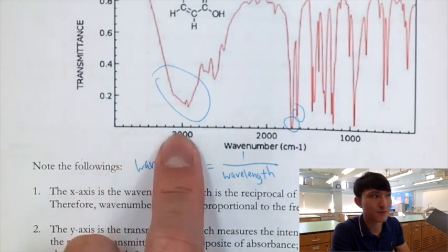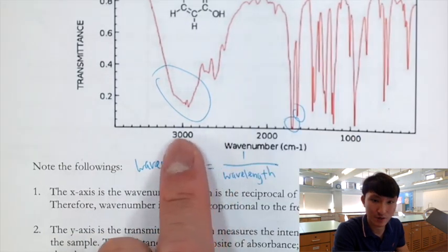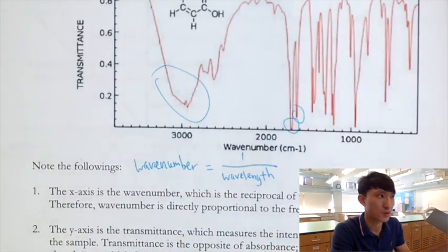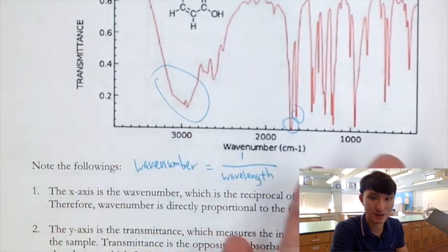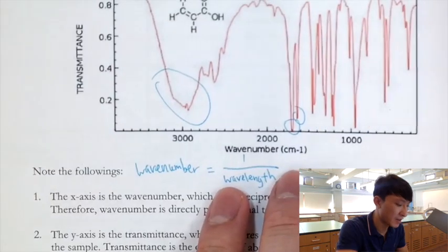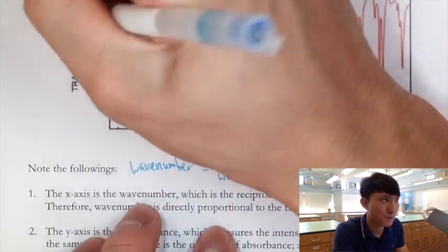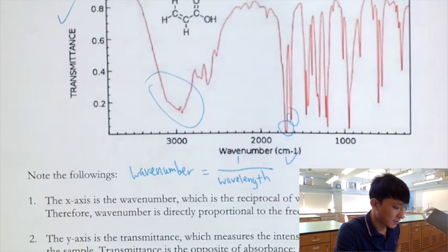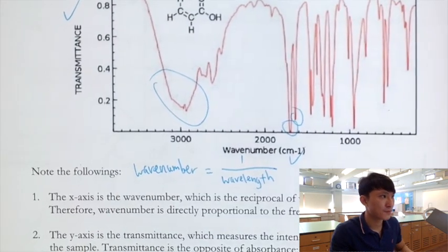But you can tell it is a different story. The larger number is actually on the left. So that's the weird point number 2 for infrared. Make sure you adapt to this kind of notation, and probably you need to know the axis label.